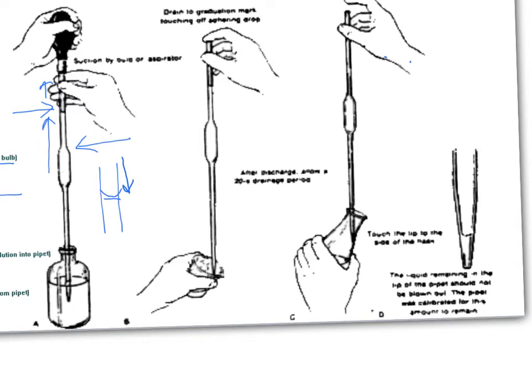Then you're going to move your pipette to the container that you're trying to fill which will be your conical flask. You're going to take the bulb off the top, remove the bulb, and allow the fluid to just run down the side of the flask at its own pace.